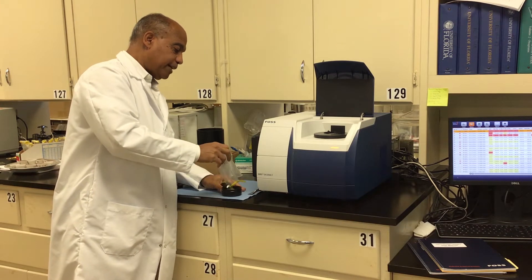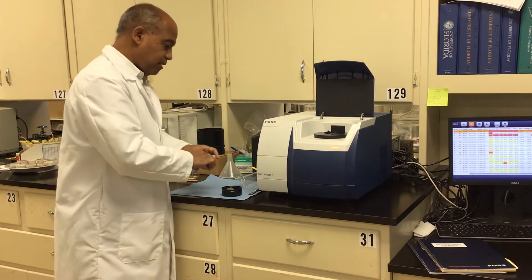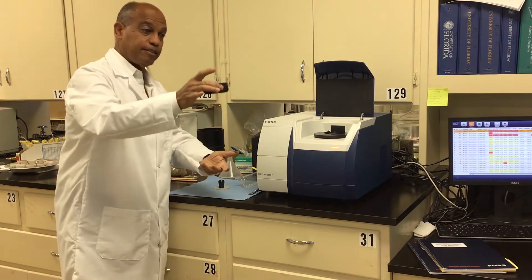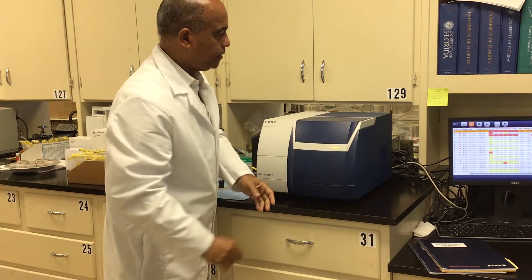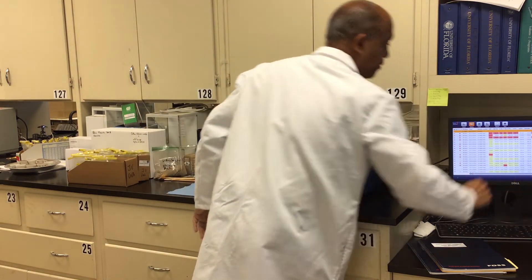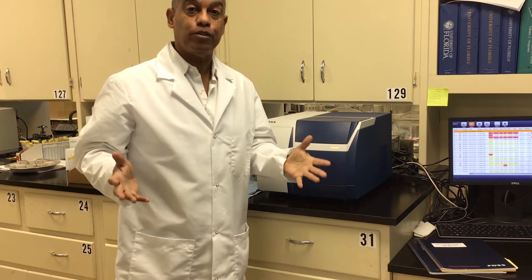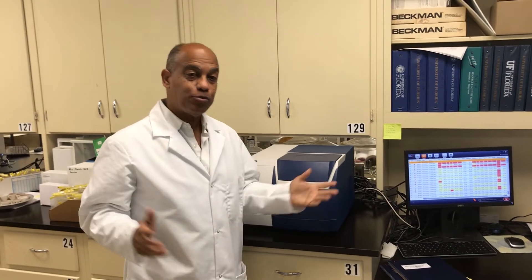Now we're adding a sample to scan on the near infrared reflectance instrument — the NIRS. The sample is put into the sample cup, the cup goes onto the instrument, and the machine runs it automatically. That will generate about 30 parameters using the prediction equation we're using for this type of grass. It takes about 30 seconds.